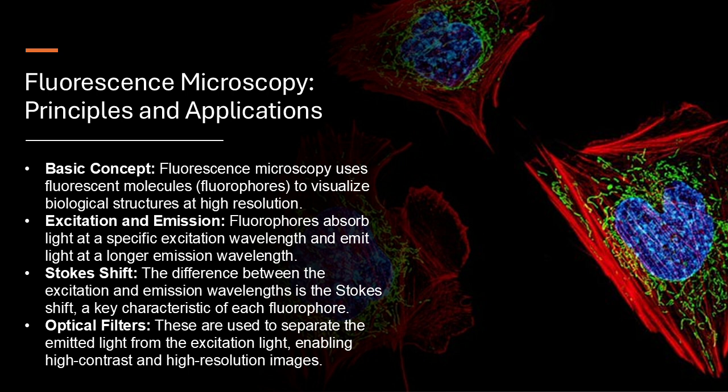So we've got these incredible microscopes. But what are they actually used for? What kind of biological secrets can we unlock with them? Oh, the possibilities are practically endless. For example, by tagging proteins with fluorescent labels, we can track their movements and interactions within the cell. So it's like putting a GPS tracker on a molecule and watching it go about its daily business. Exactly.